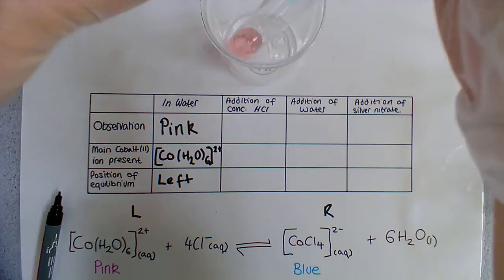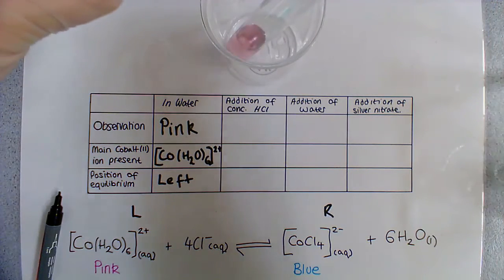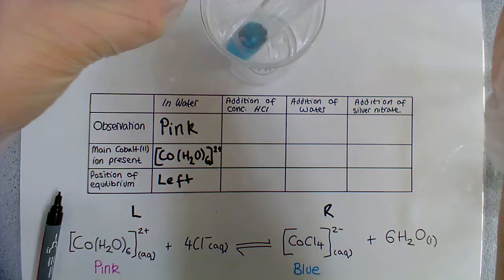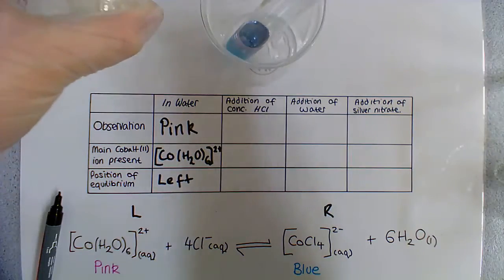So you might see as I'm adding it, the colour changes slightly. I'm going to keep adding until I see a full colour change, because that will tell me when I've pushed the equilibrium all the way to the opposite side.